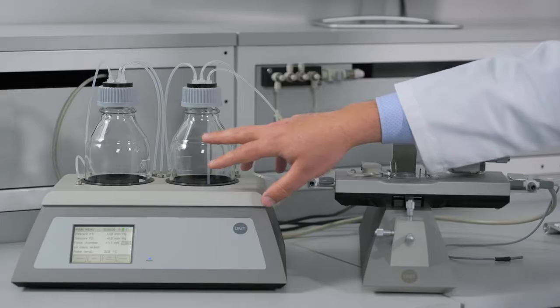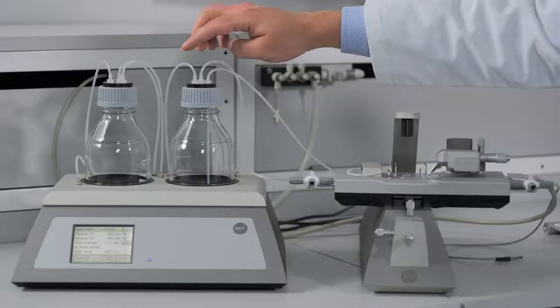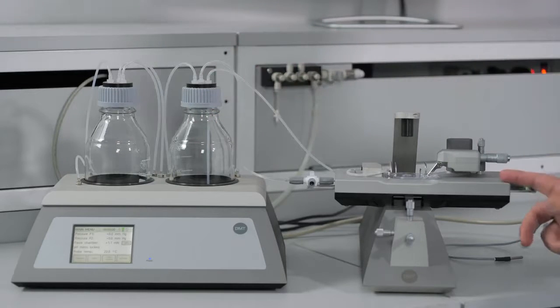The bottles actually house the pressure that you will use to pressurize and create flow in your system. The tubing will regulate the pressure in the bottles as well as send that pressure to your chamber.